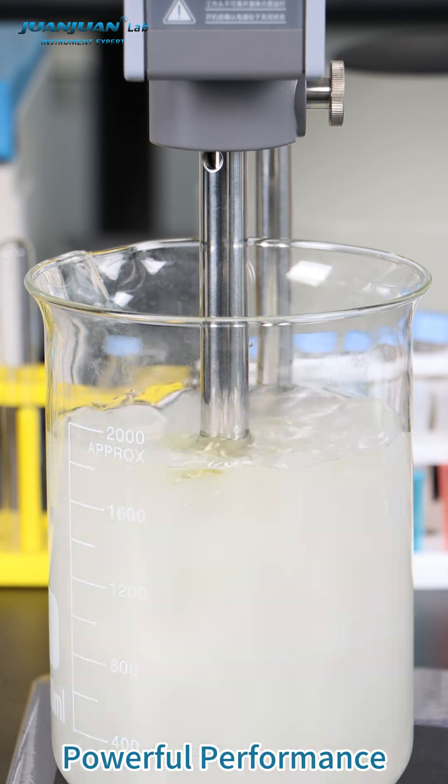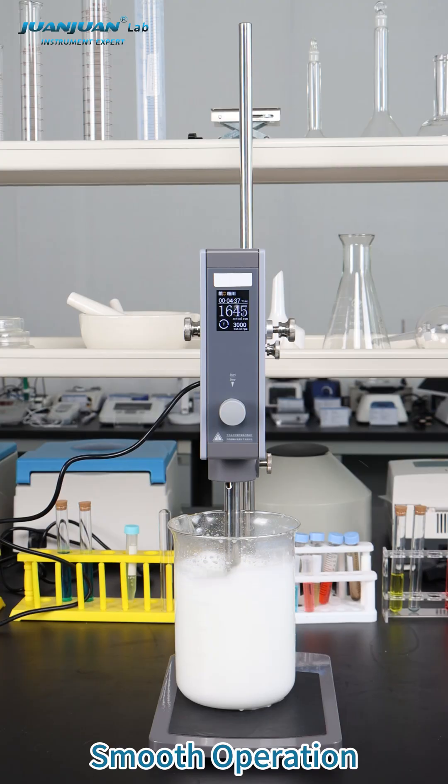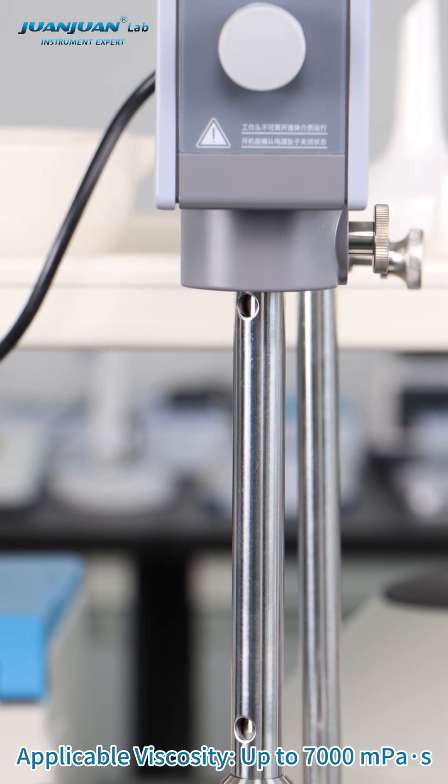Brushless motor. Powerful performance. Smooth operation. Applicable viscosity up to 7,000 mPa·s.